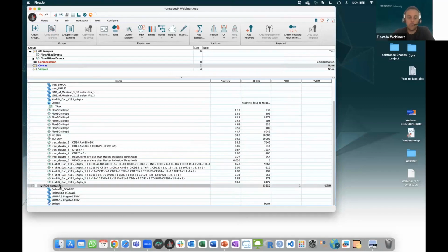And you can do that, of course, for a dimensional reduction, but you can also do it for a clustering algorithm. For a dimensional reduction, we're going to try to see the distance between each other's cells. For a clustering algorithm, when you do embed, it's just going to be a yes or no answer. Is it cluster 1 or is it cluster 2? Is it cluster 3? And we're going to try to calculate.